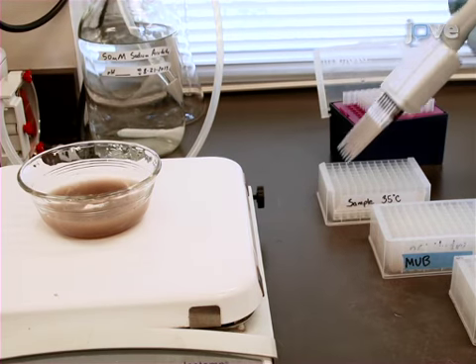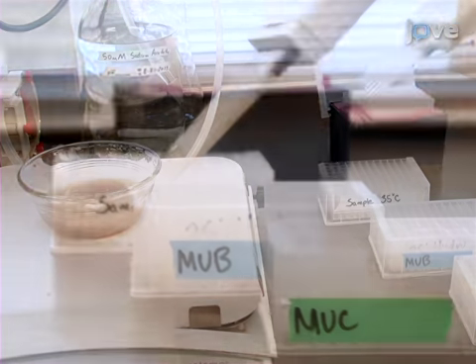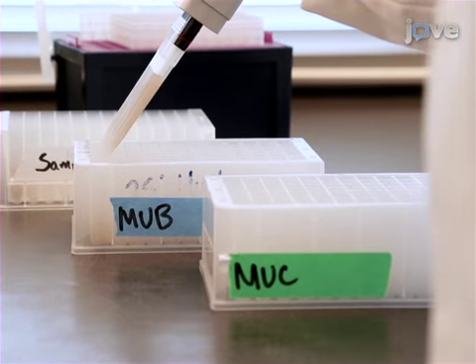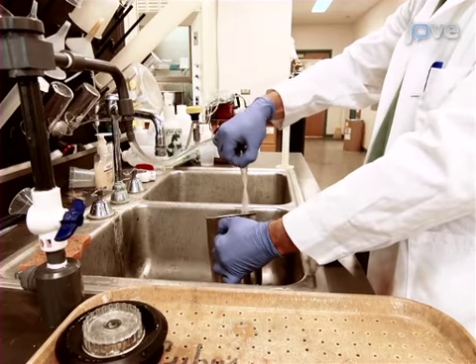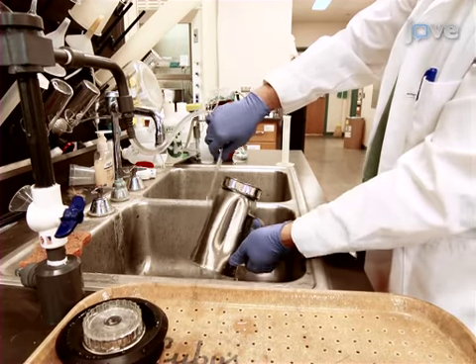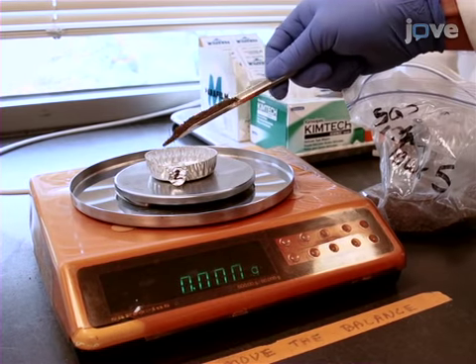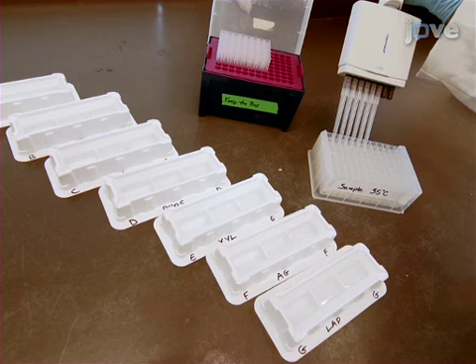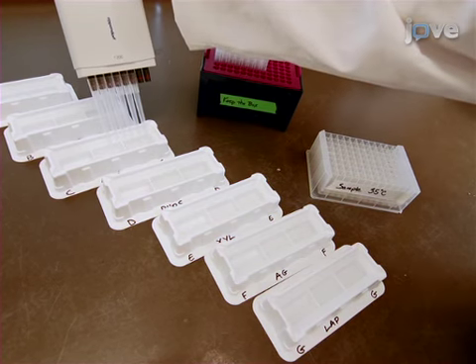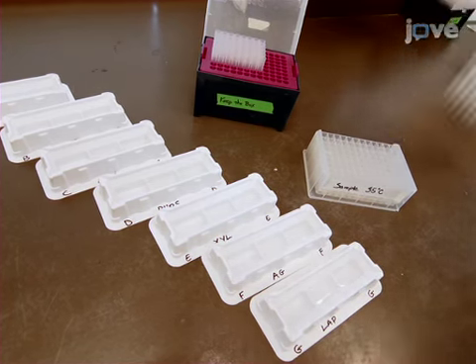Then pipette 800 microliters of soil slurry into the first column of the sample plate. Do the same for the first column of the MUB standard and MUC standard plates. Rinse the blender, stir plate, and stir bar with deionized water or buffer between soil samples. Repeat this process for each soil sample, moving to the next column with each subsequent sample. Next, pipette the appropriate substrate into the corresponding wells of the sample plate as listed in the text protocol. Prepare a sample plate for each incubation temperature to be tested.